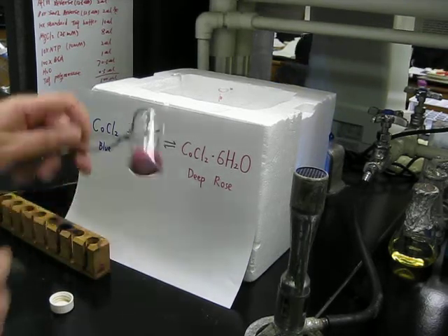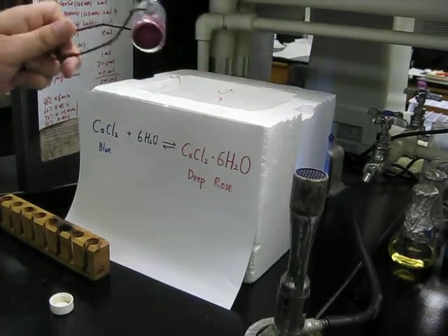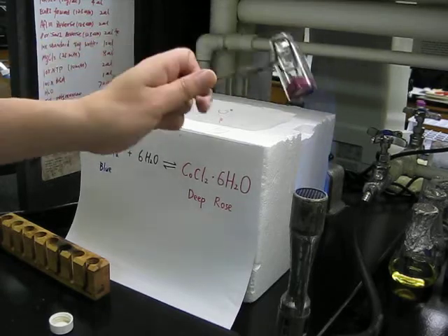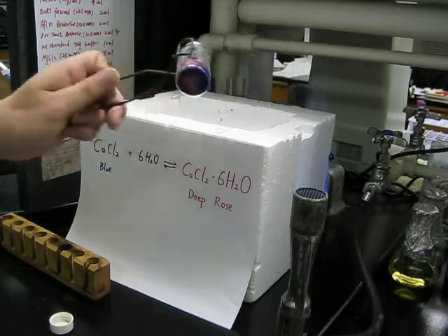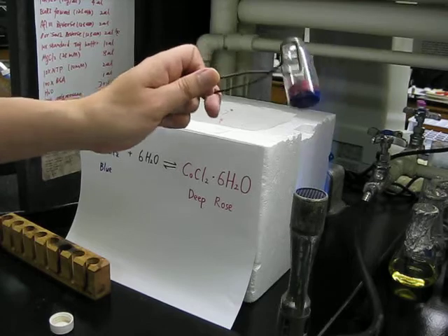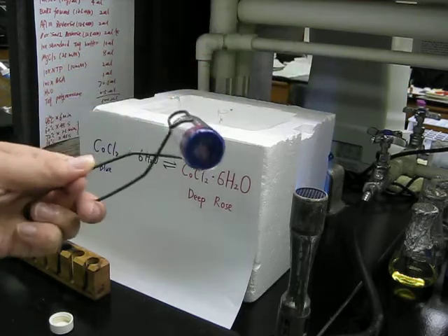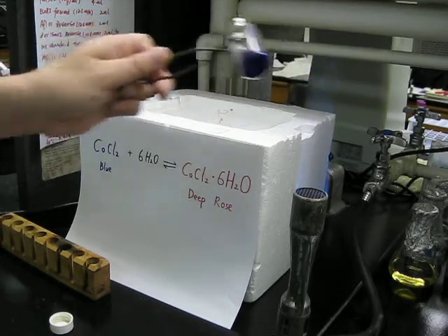Okay. So I just try to heat gradually. If I heat for a very long time and then do not move it, what happens is it will crack. So that's why I wanna just slowly and gently heat it. Okay. So now with the heating of this solid cobalt chloride with 6 hydrate, if we look at the bottom, which has the highest temperature, we can see clearly the color has been changed to this blue, right?